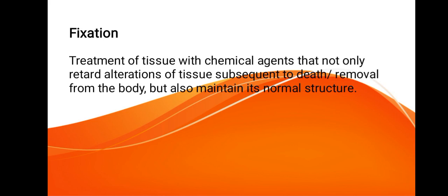Fixation refers to the treatment of tissue with chemical agents that not only retard alterations of tissue subsequent to death or after removal from the body, but also maintain its normal structure. Fixatives act to preserve the cells and extracellular substance of tissues or even organs, and prevent autolytic, that is the degenerative changes, from taking place.